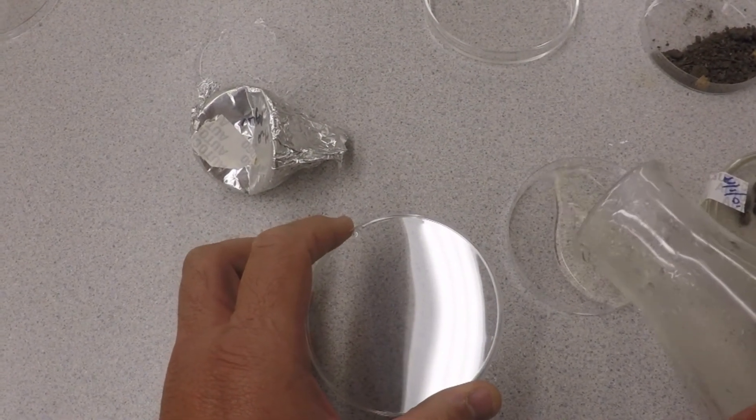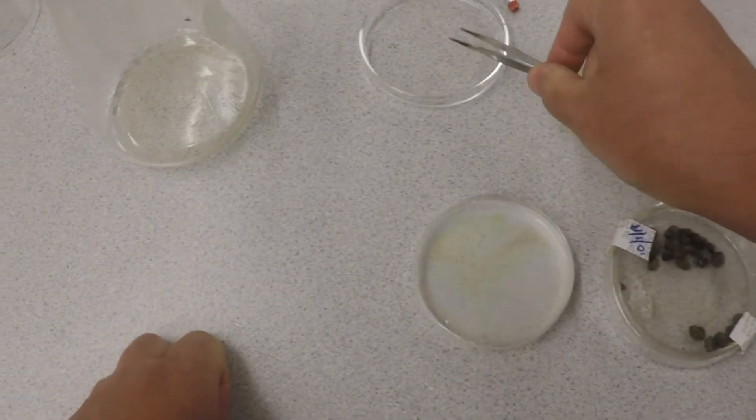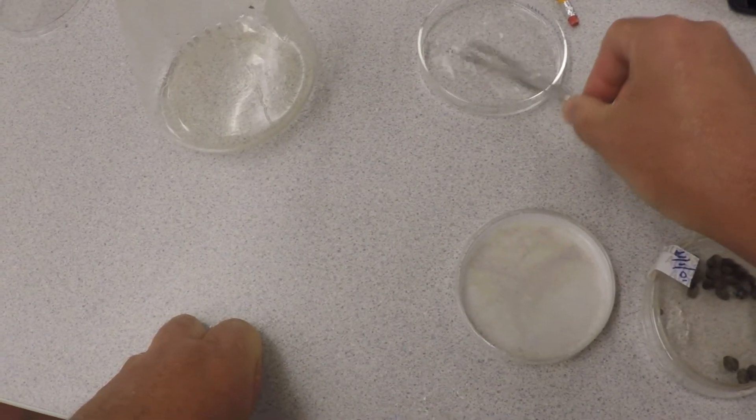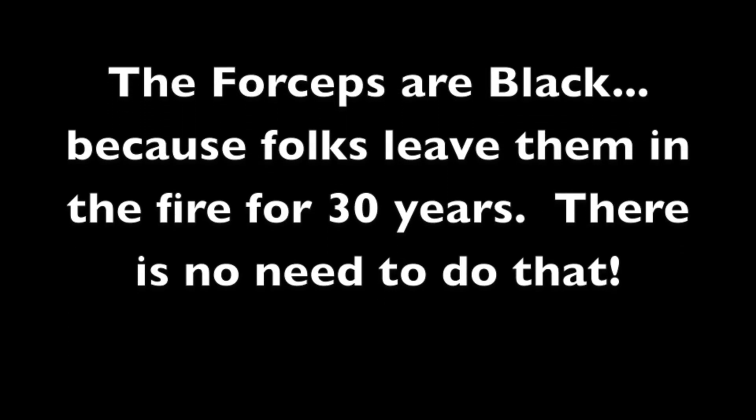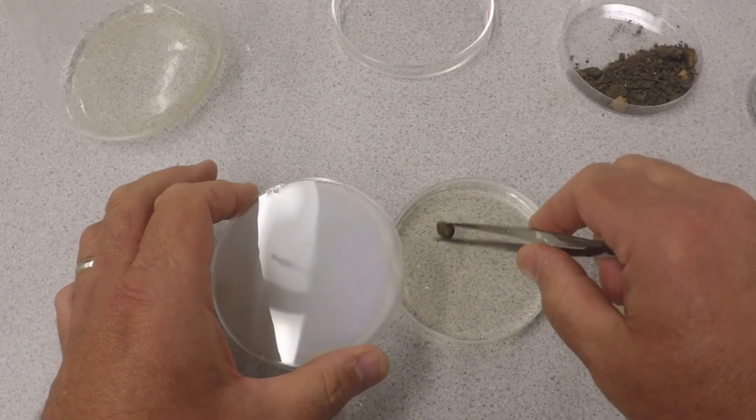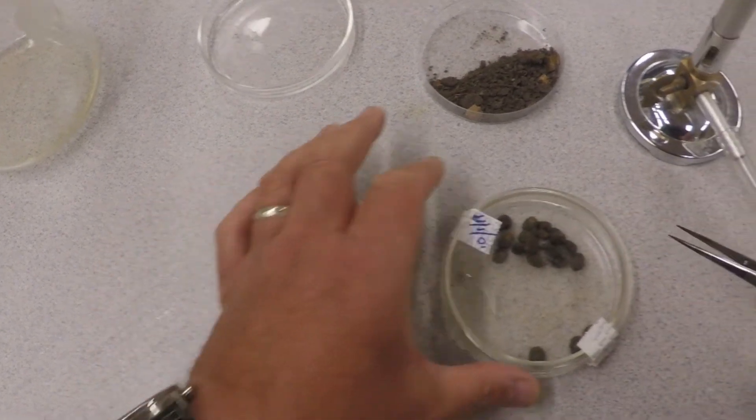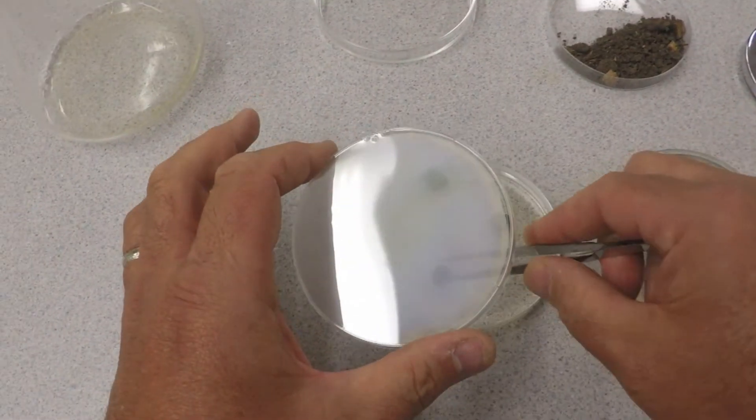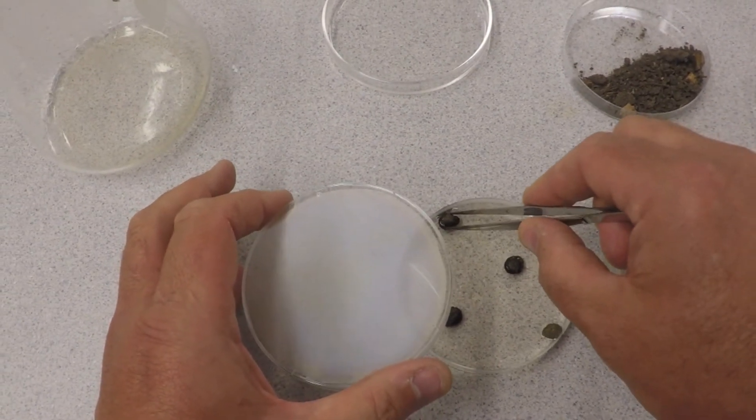These can be a little thicker than usual because you're going to leave these things for quite a while. Now you take your forceps, put them in some ethanol, flame it just to surface sterilize the forceps. And then you grab a few of these little dung pellets and you just pop them into the water agar.